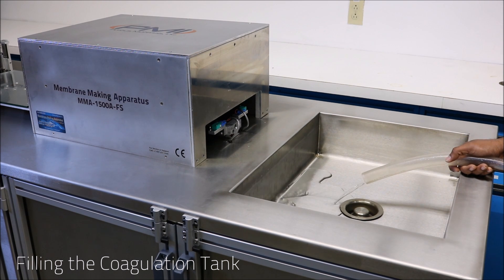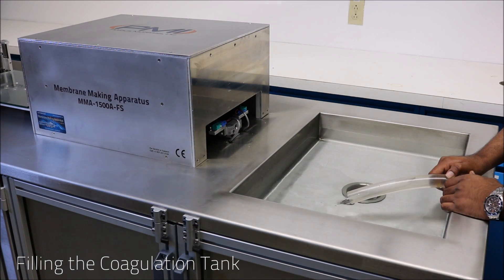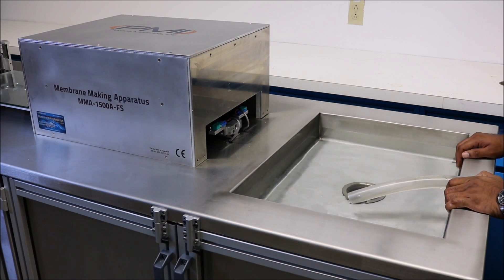Fill the coagulation tank with water to roughly 2 inches from the top. This will allow for submersion of the plate later on. Next we will move the plate back in order to pour the solution.